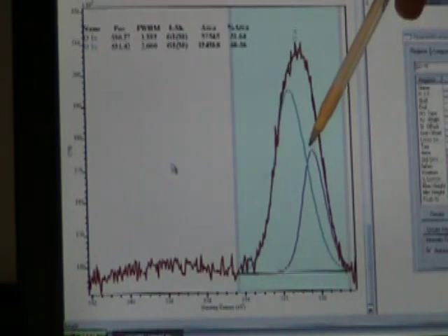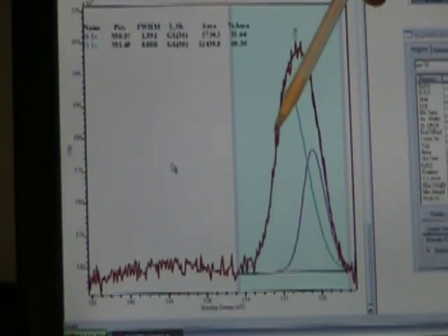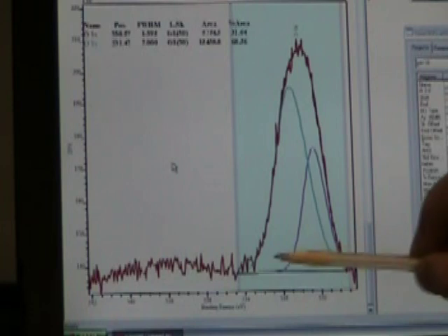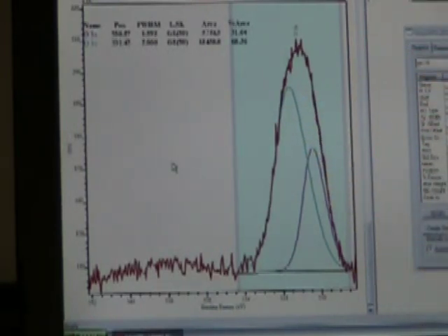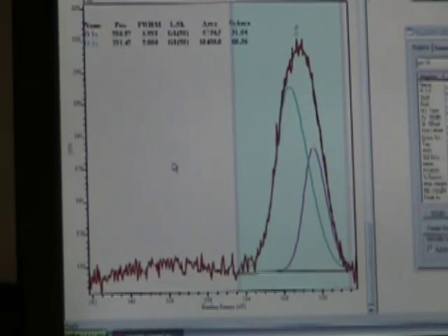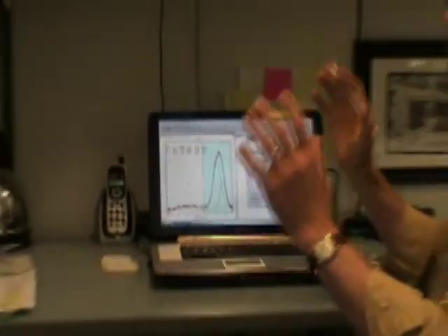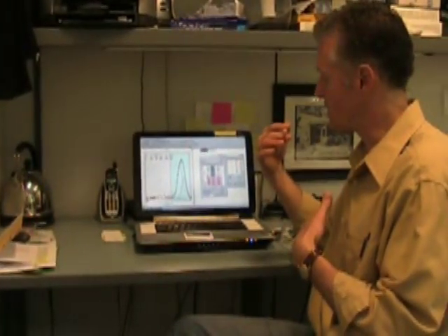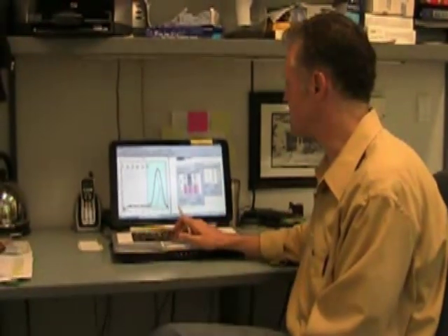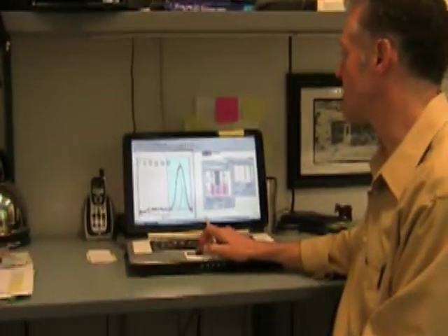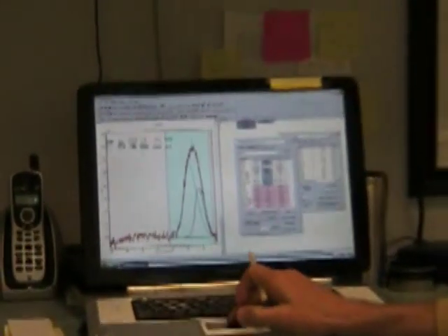And then this peak down at 530, which is clearly oxygen that is bound to a metal. Oxygen that's just sitting on the surface as H2O or CO2 would be well out here in the 533, 534 range. And we could have fit this to show a little bit of presence there. And when you're doing these fitting routines, it's never a guarantee from the outset that you're doing it right on the first go. You have to constantly be going back between your high-resolution scans and your survey scans. And again, you have to come up with some sort of story, some sort of explanation, that makes sense out of all of the high-res scans and the low-res survey scans all at the same time. All the numbers have to add up.